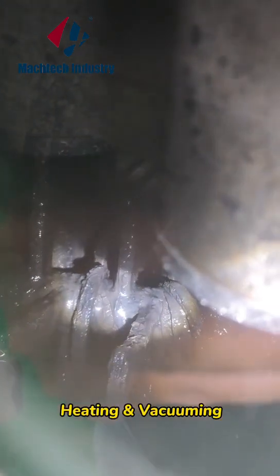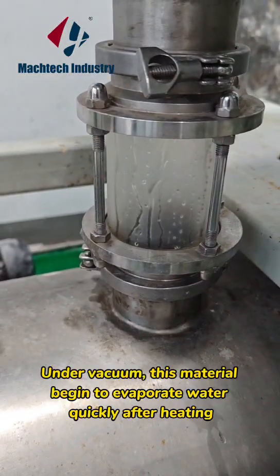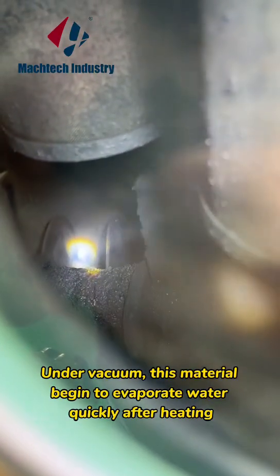Heating and vacuuming. The sight glass can observe the evaporation of solvents. Under vacuum, this material begins to evaporate water quickly after heating.